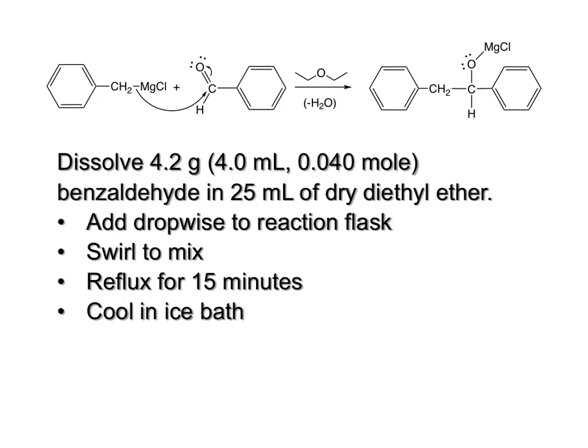Now, while you are refluxing, once you've got all your benzyl chloride added and you're making your Grignard reagent, you can start to prepare your benzaldehyde solution. You're going to take 4.2 grams, or right at 4 milliliters of benzaldehyde, and again, measure this in something that was in the oven that is dry.